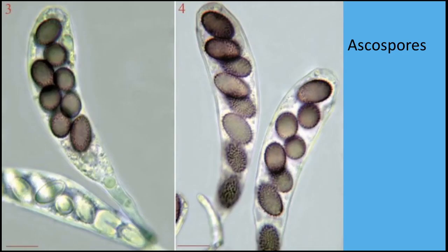And this is a very fun thing to do, to look at spores under the microscope. Just to give you some examples of what spores of the Ascomycetes might look like, and these are in the ascus. Remember the really club-shaped, sort of like a pea in a pod structure. So the ascospores are inside an ascus here, and the individual little balls are the spores. And the same happens here. Look, some of them look like almonds. It's very cute, but they're tiny underneath the microscope. You can just barely sometimes see them. They're tiny little things, but really cool. And you can stain them with different stains, so it makes them more visible.